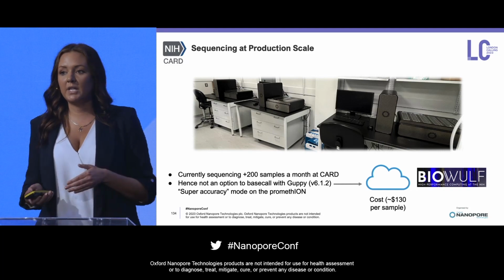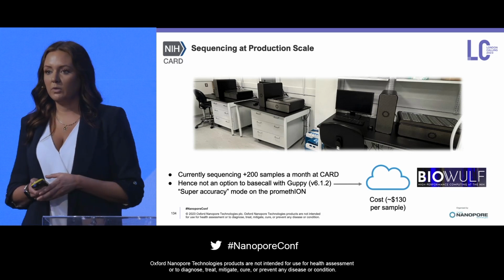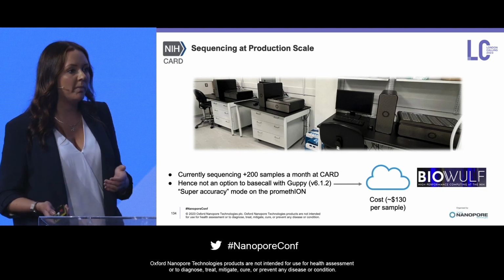We've also got the option at NIH to do it on the NIH HPC server, which is called Biowulf. The added benefit of that is we can do the samples for free, but we have to do it in small batches.